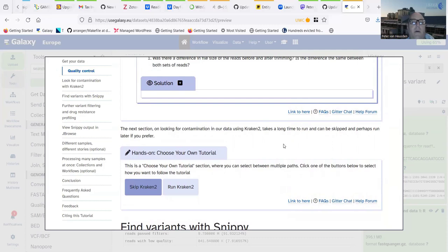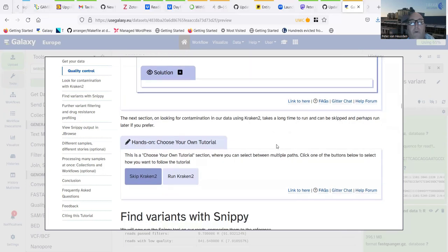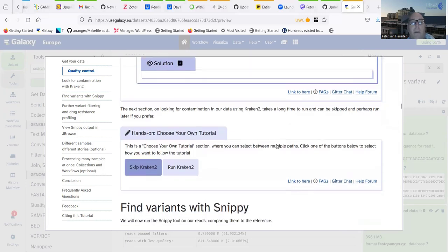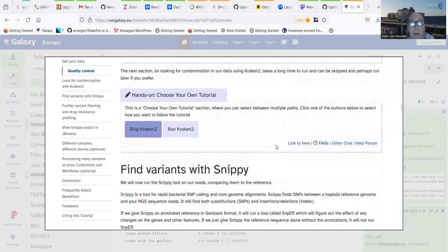At this point we can choose to run Kraken 2, a tool used for identifying the likely species a read comes from. I'm going to skip this step for now because it's quite a long-running tool — I'll show you later what a Kraken 2 run looks like. When you do the tutorial yourself, you can choose to run it, leave it running, carry on with the rest of the tutorial, and come back to its results at the end.